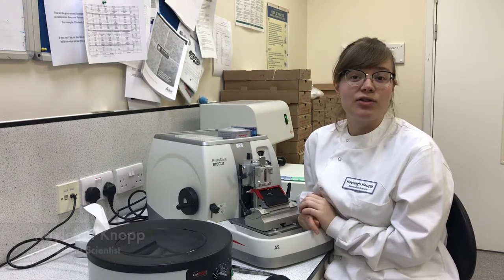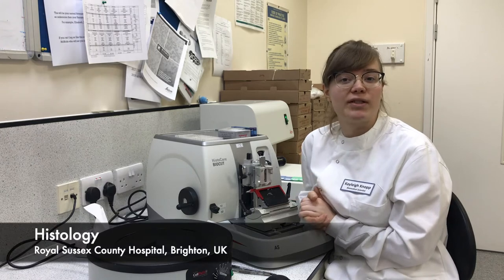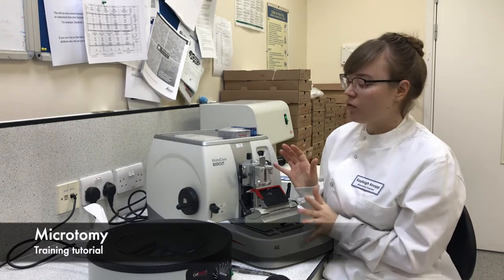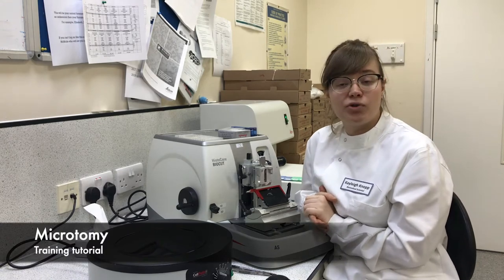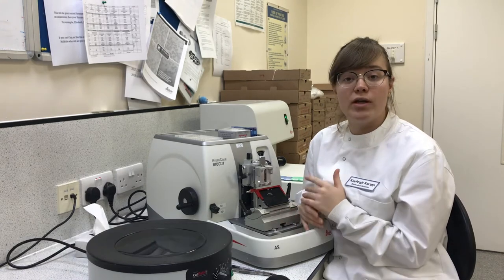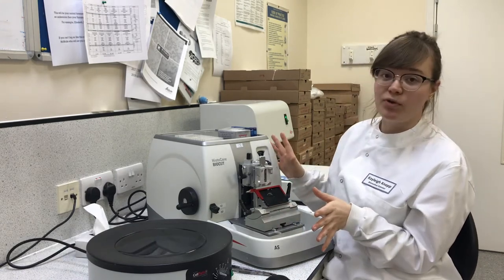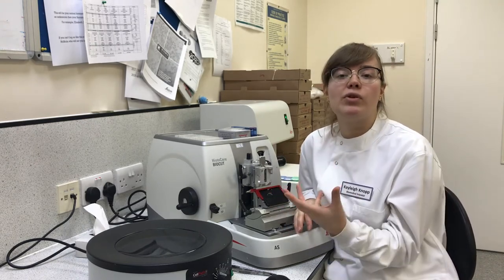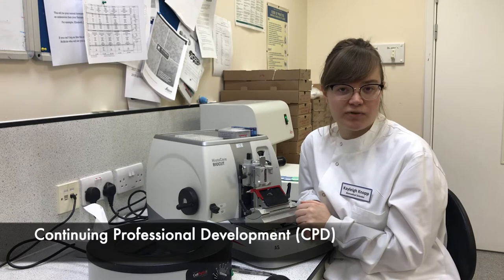Hi, I'm Katie Knopp, a biomedical scientist at the Histology Lab at Royal Sussex County Hospital in Brighton, and I'm here to give you a microtomy tutorial. This tutorial is good for beginners who've never seen a microtome before, or even for competent staff looking to review their knowledge as part of continuing professional development.